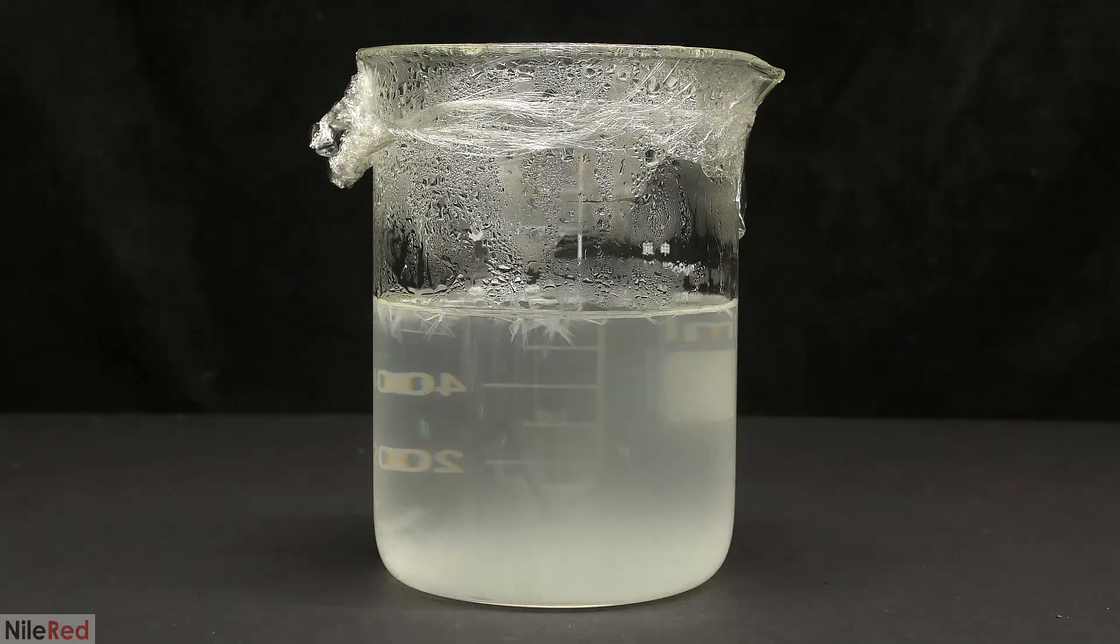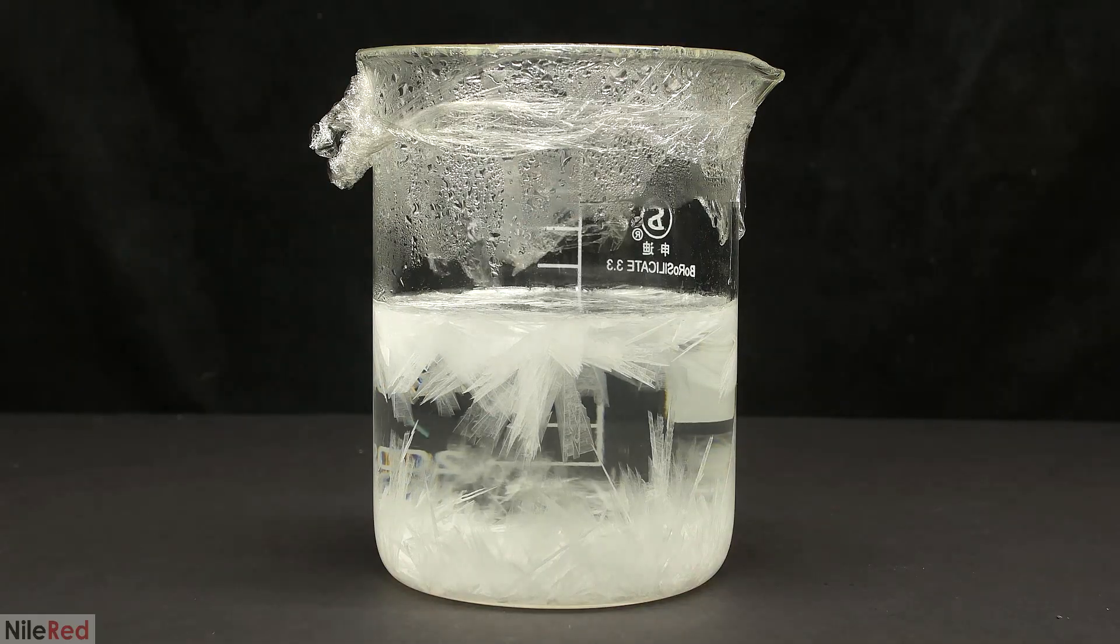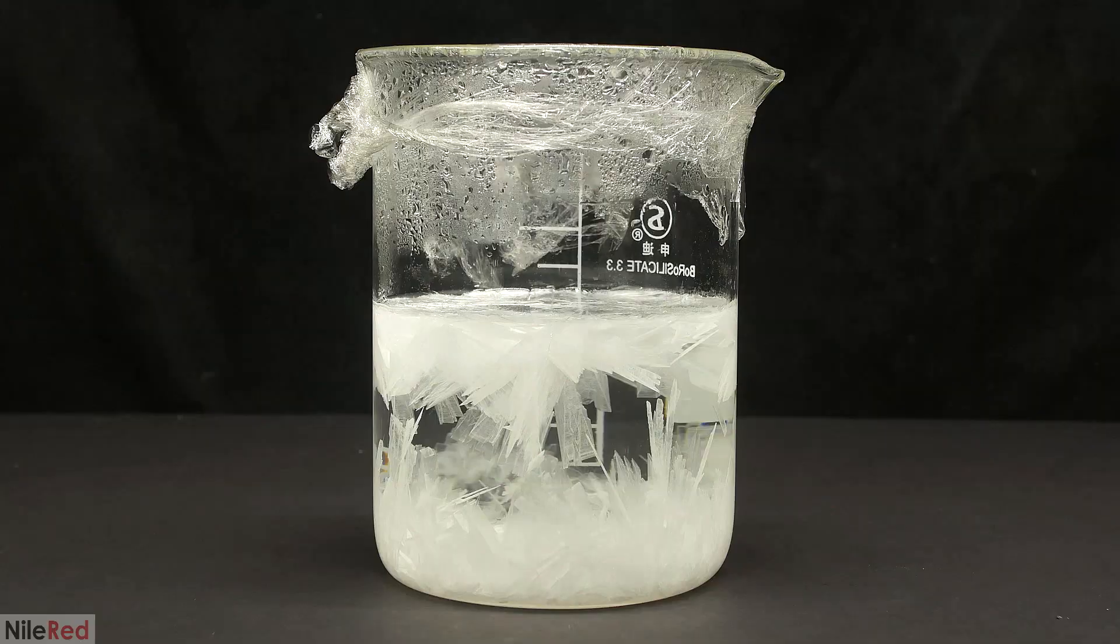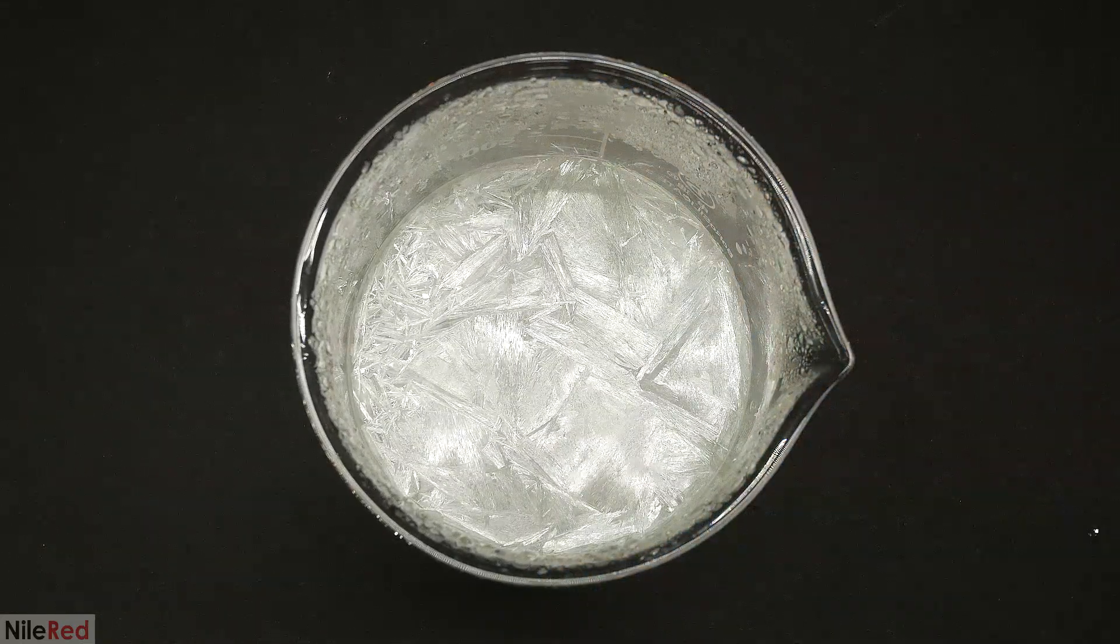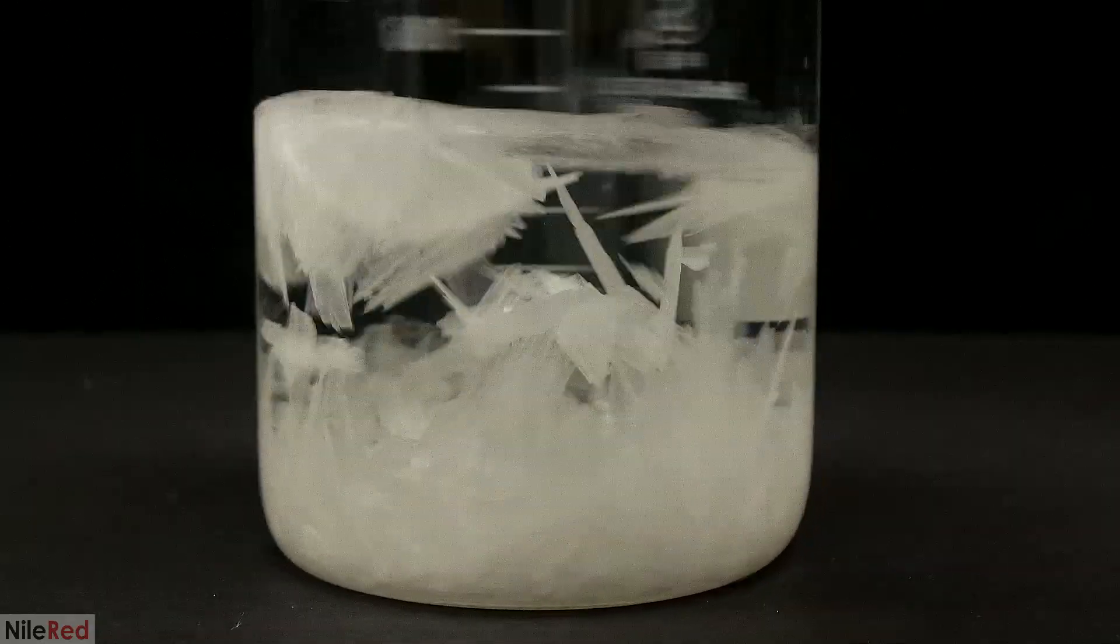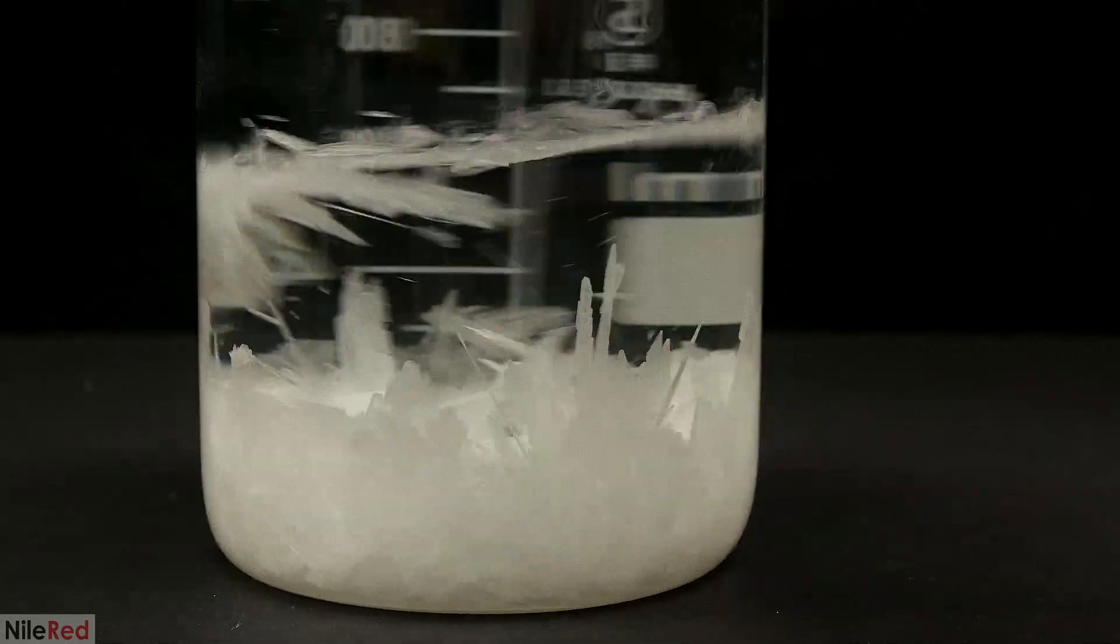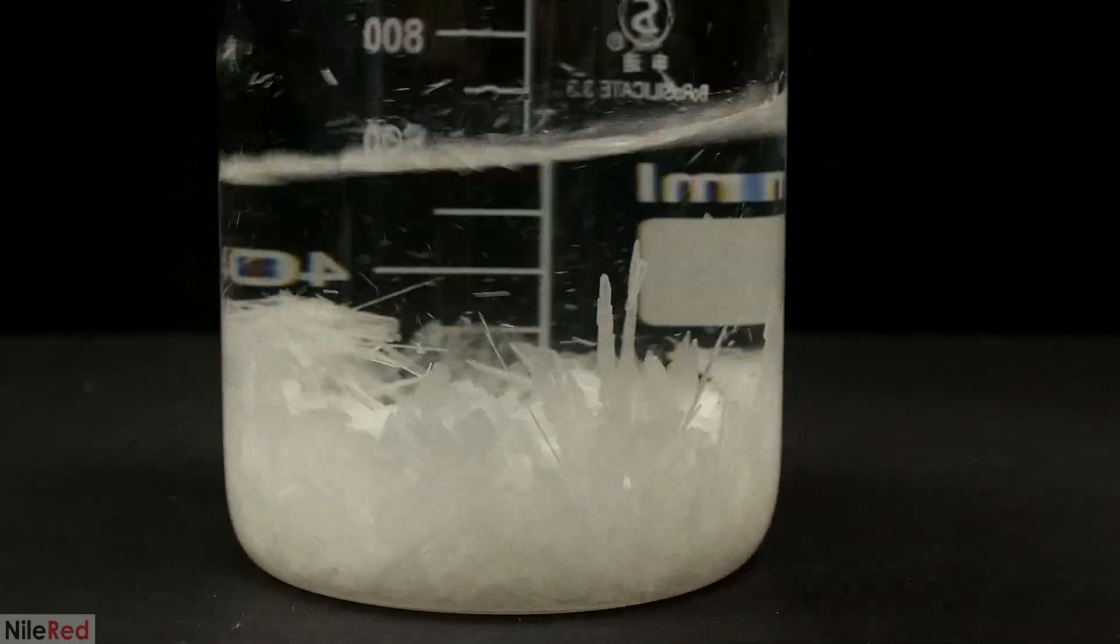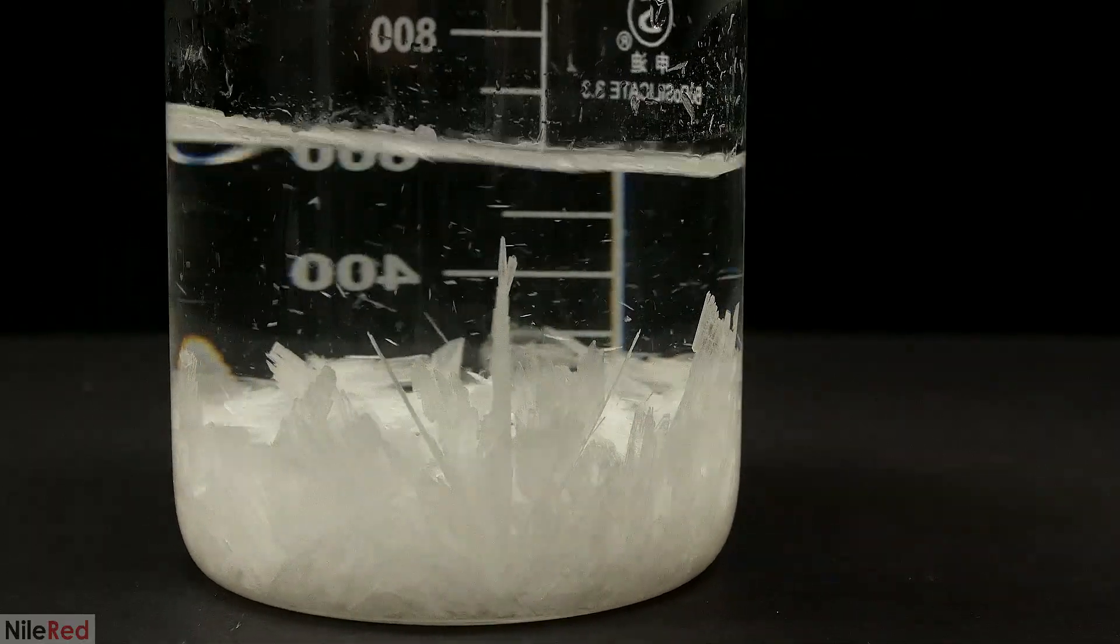As the solution cools, the solubility of acetanilide will slowly decrease and we should start to see something precipitate out. I took a time lapse and this is what happened over the course of about two or three hours. When it was done, there was a very nice layer of crystals at the top. I shook it around to knock everything to the bottom and then I cooled it to about 5C for a few hours. By cooling it, I am further decreasing the solubility of the acetanilide and it should help to get out a little bit more.